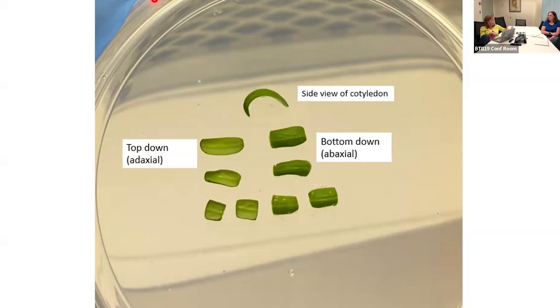Mm-hmm. So you just want to explain a little bit. Yeah, so I take all of my explants that are incubating in the magenta box, and I pour them all out onto the paper towel. So is it one layer of paper towel? Two layers of paper towel. This long, white paper towel. If I'm using 25 mils of agro, it's 2 layers of paper towel, and that should be enough. And the corners of your paper towels are usually dry at that point.